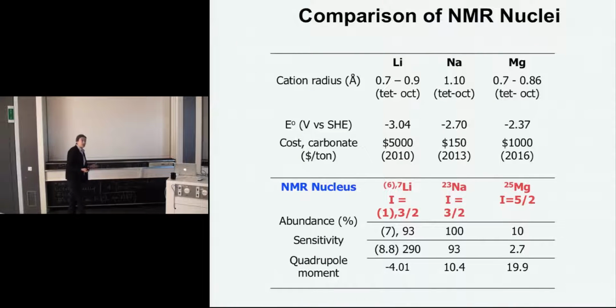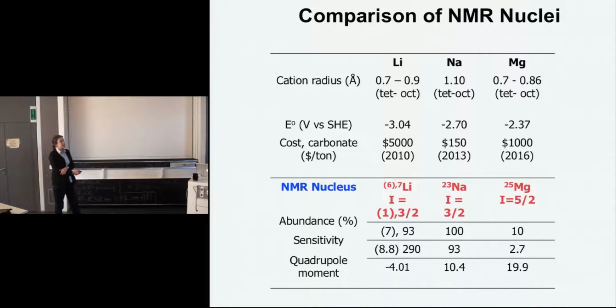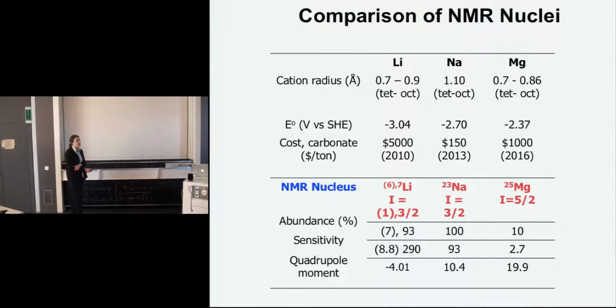Okay, so I'm an NMR spectroscopist primarily. That's at least my background, although I'm also a solid-state chemist. One of the nice things for us is that we've spent a lot of time trying to push the use of spectroscopy, particularly lithium NMR, in this field to see what sort of information we can get out of it. This is the normal slide that battery chemists would give in terms of lithium, sodium, and magnesium, comparing the costs of the resources. And this is my slide where I show you the different NMR active nuclei. For us, the interest is that sodium is 100% abundant. Magnesium is low abundance and also very low sensitivity, so it's going to be a challenge.